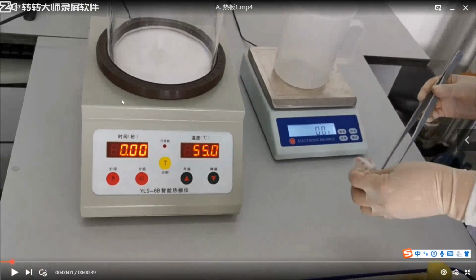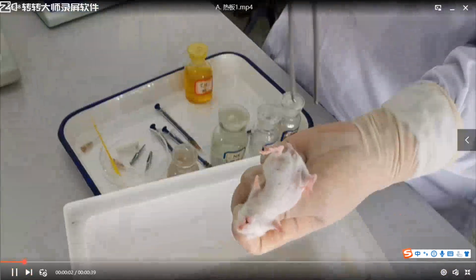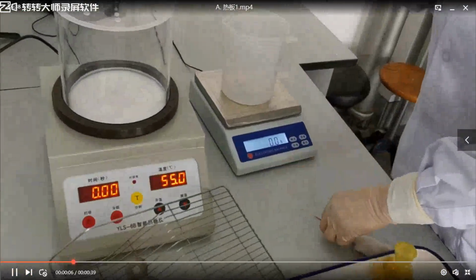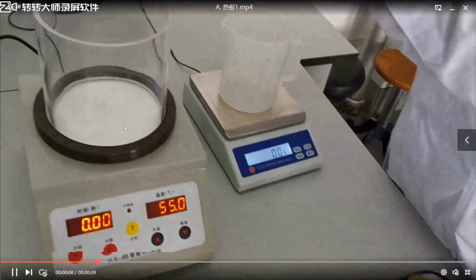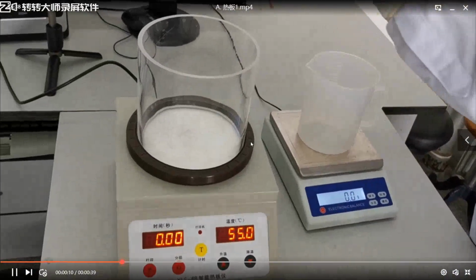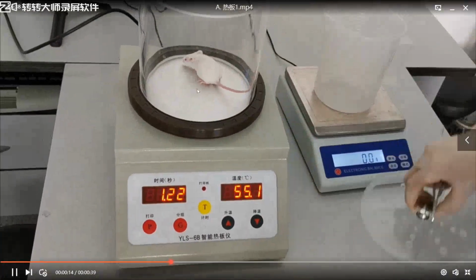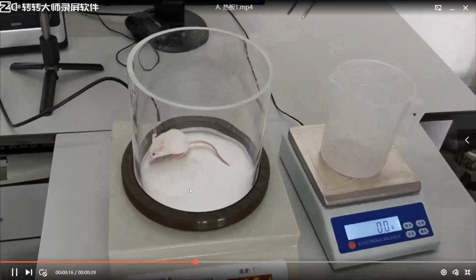Okay, we have prepared the hot plate at 55 centigrade, and we have also prepared the electronic balance. Take the first mouse, put it onto the hot plate and test its pain threshold.